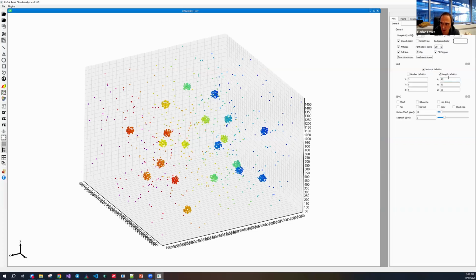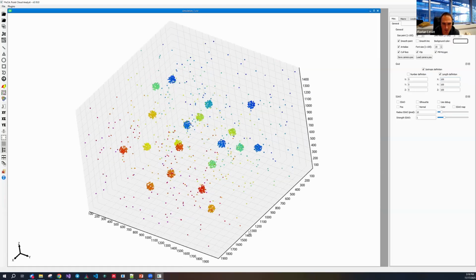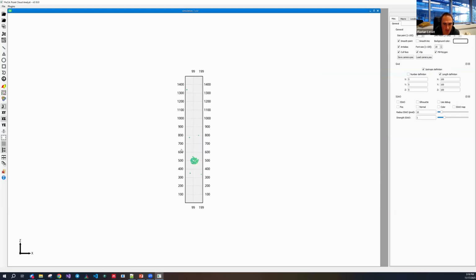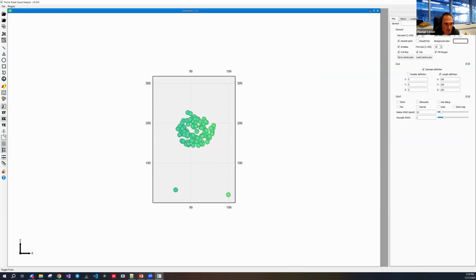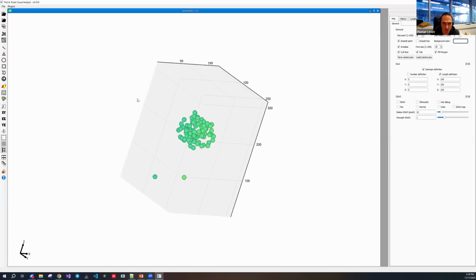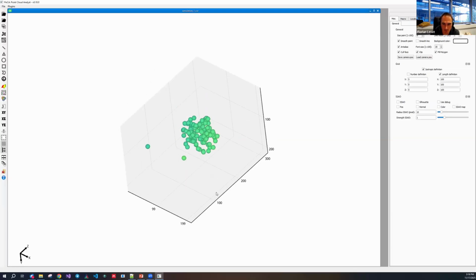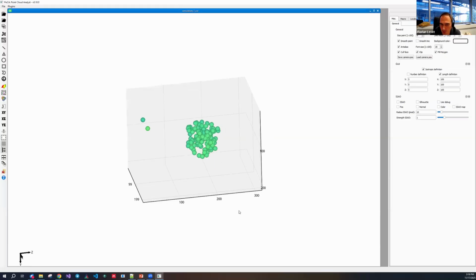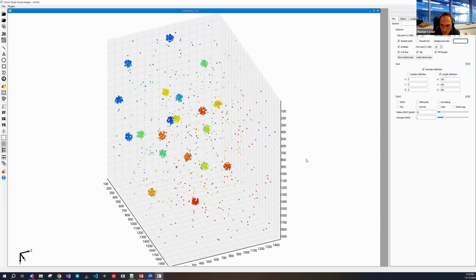So here that would be, for instance, a line every 100 nanometer. And so it can really help to have an idea of the size of your object, especially after doing some cropping, because now you can really see that you have something that is around 1 to 100 nanometer, basically, for this sphere.